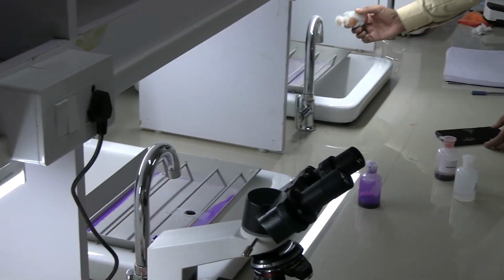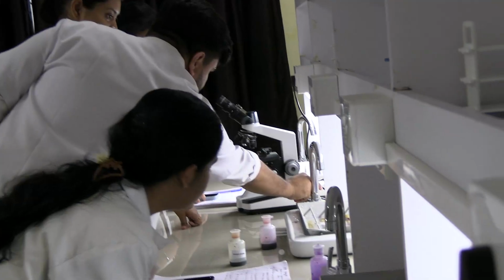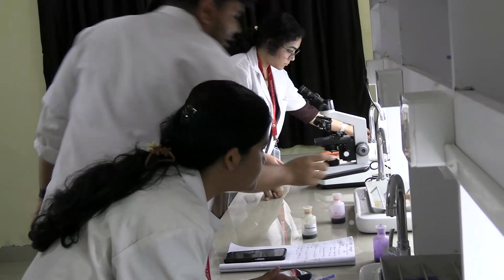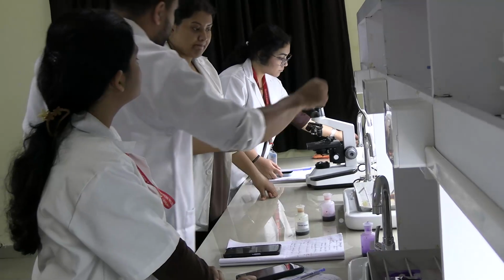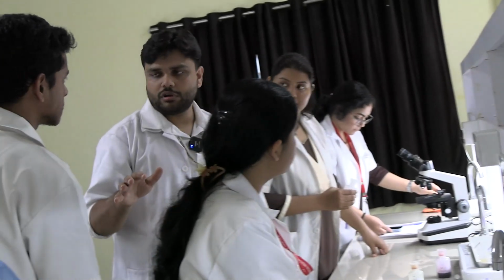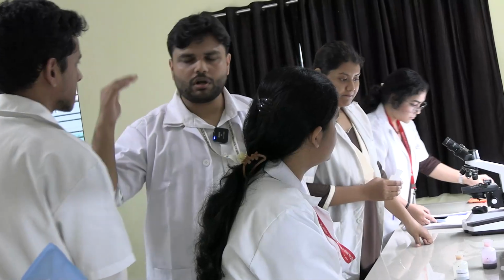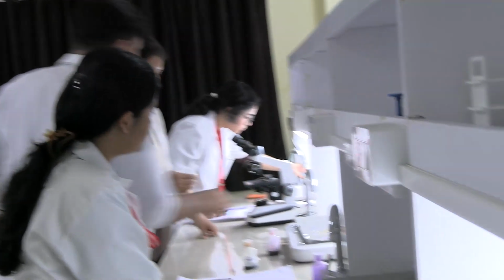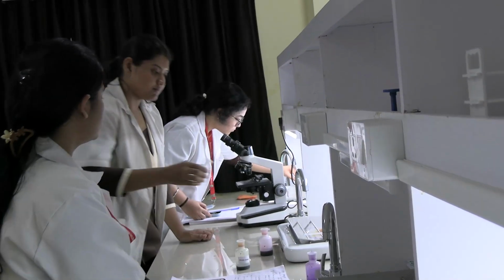It at a very low speed, okay? Okay. I think that's enough. You're gonna pour the decolorizer and you're gonna wash it immediately. You're not going to wait for some time like 1, 2, 3. No. You're going to pour 2, 3 drops and you're going to wash it directly because 2, 3 seconds is a very short time. Okay?